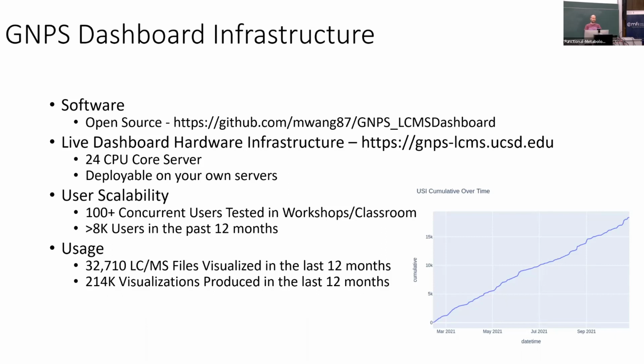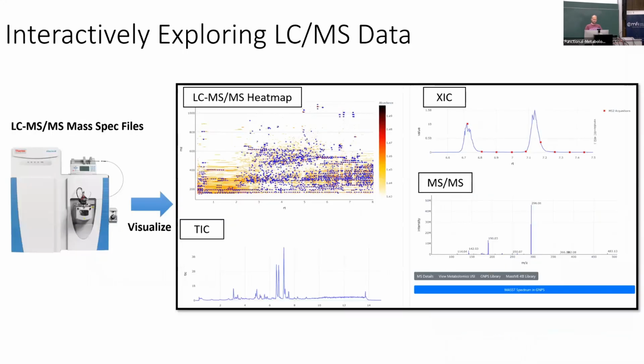So far, we showed scalability in a couple of events with 100+ users at the same time. Sometimes it gets a little bit slower, but it was still holding up, and quite some people have been using it, and quite some files have been visualized in the dashboard.